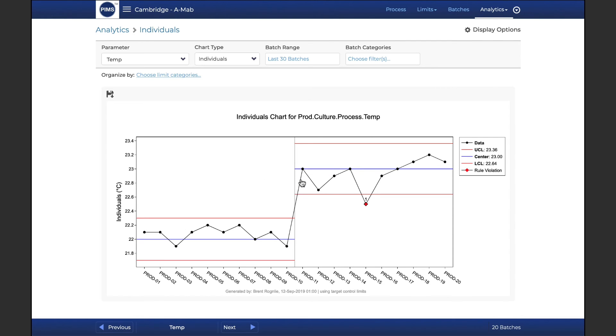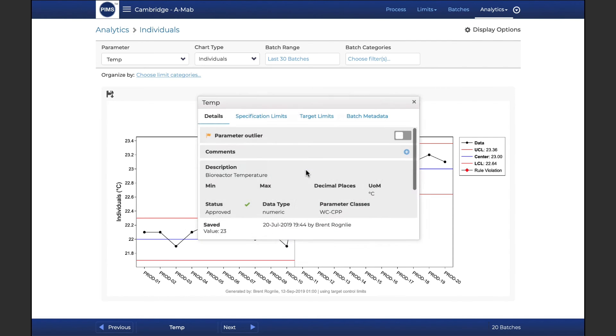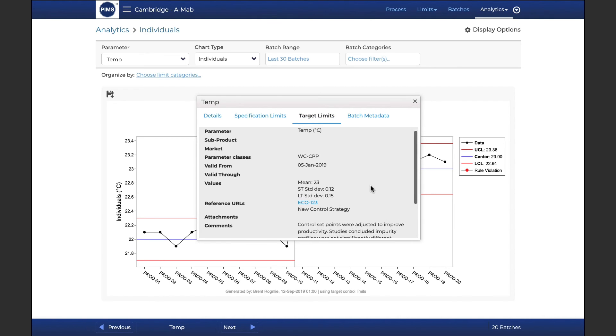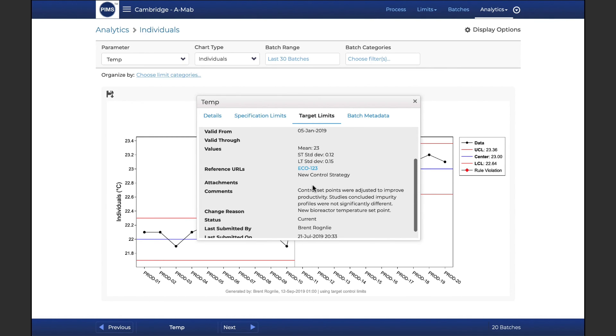Such as individuals and moving range, process capability analysis, normality testing, and more.